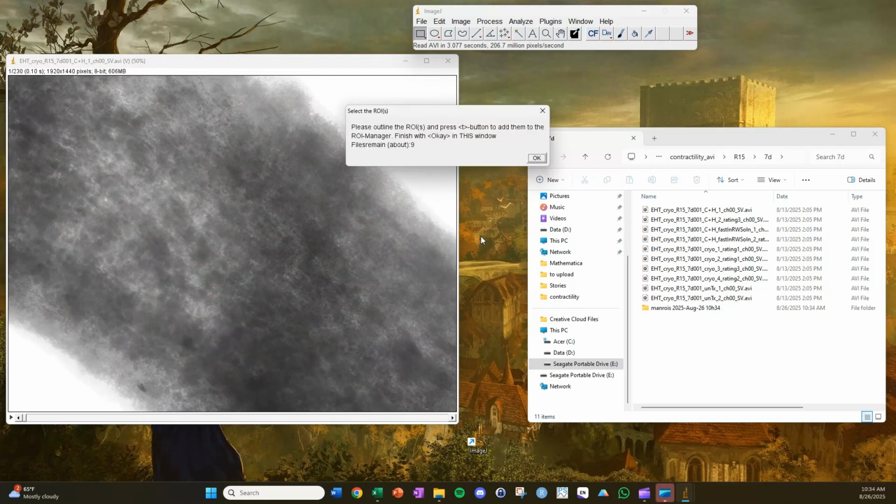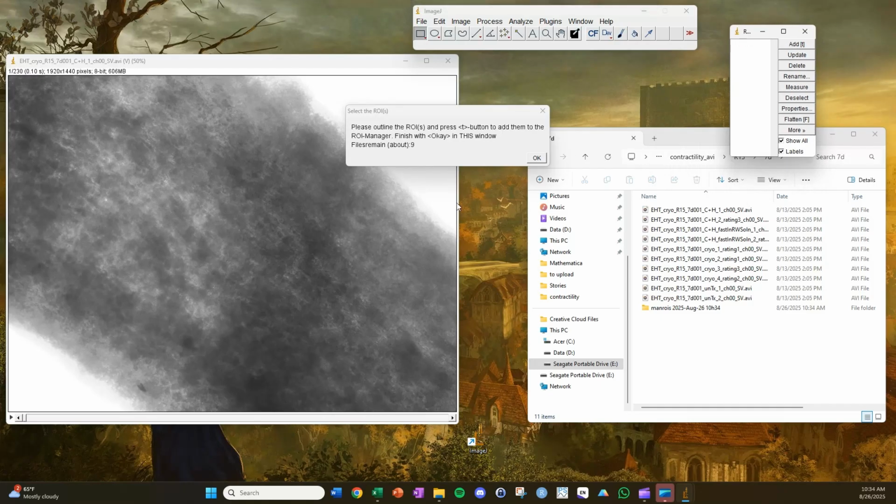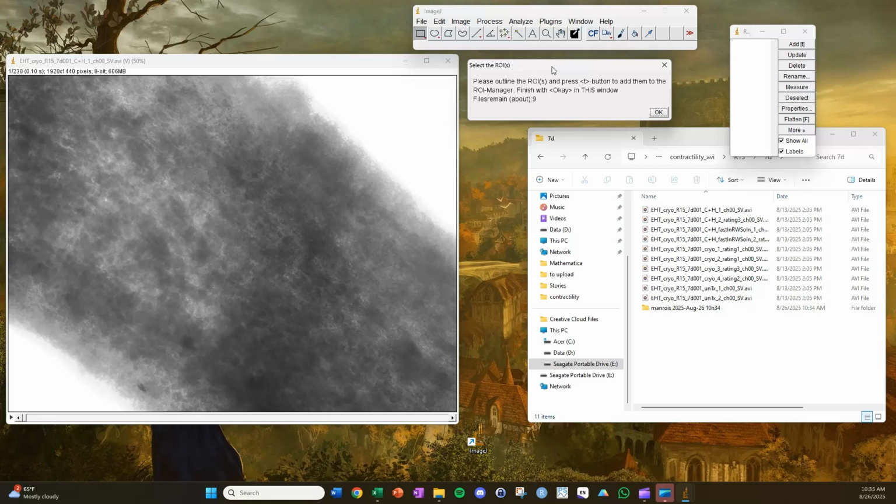And you might notice that there are other options in MYOCYTER to do this a different way. The way I think makes the most sense and gives me the most confidence in the analysis is to manually draw the regions of interest. It's not particularly time intensive for a tissue because you only have one region of interest to draw per video.